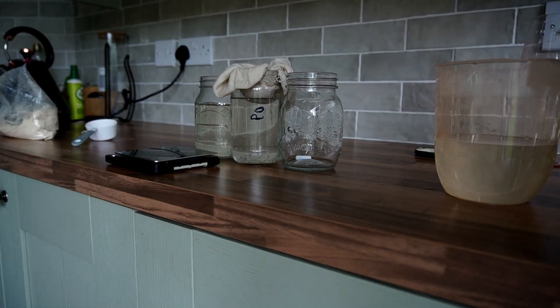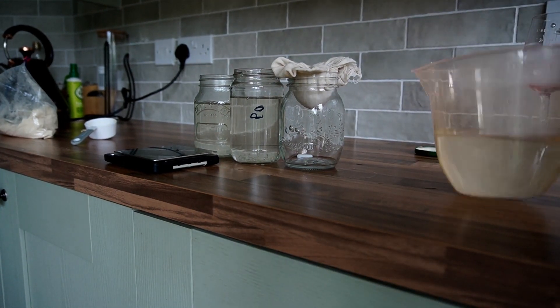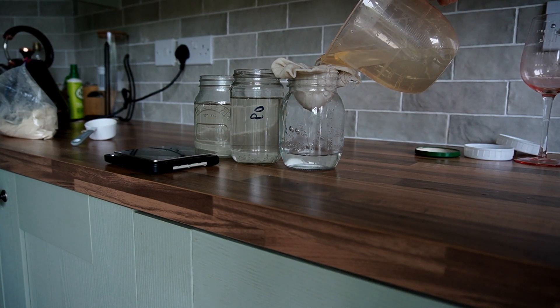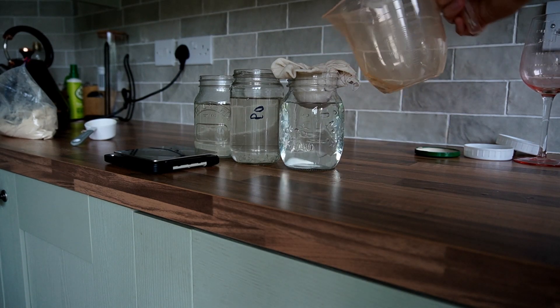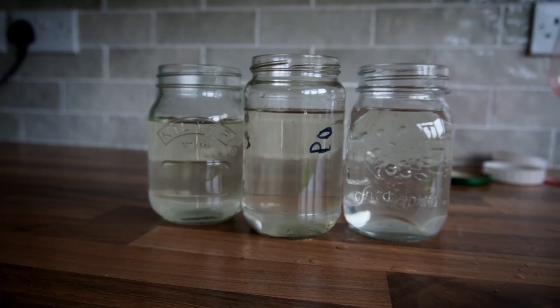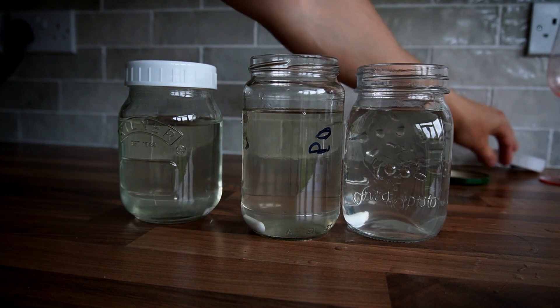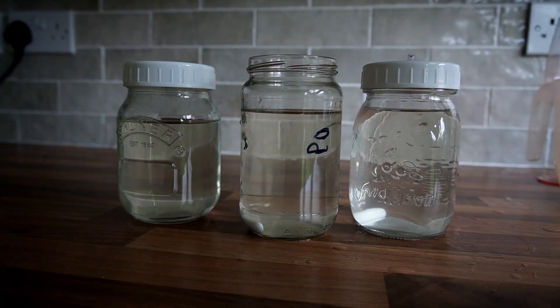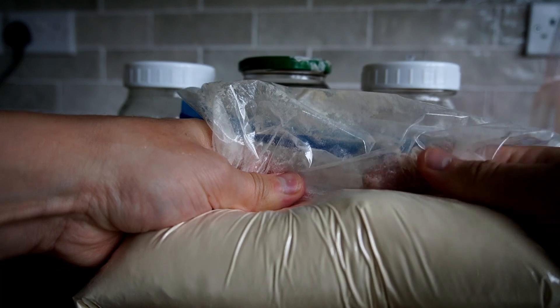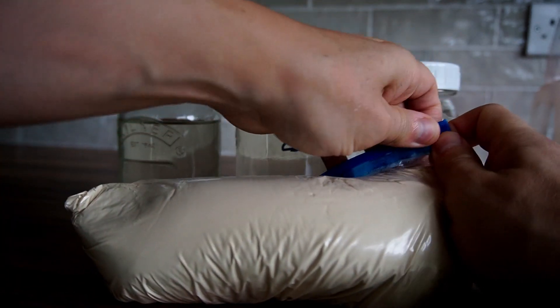Repeat this step for each of the jars and then put the lids on. When storing your light malt extract, make sure you push out as much air from the packaging as possible, then zip it up — this means it will keep for longer.